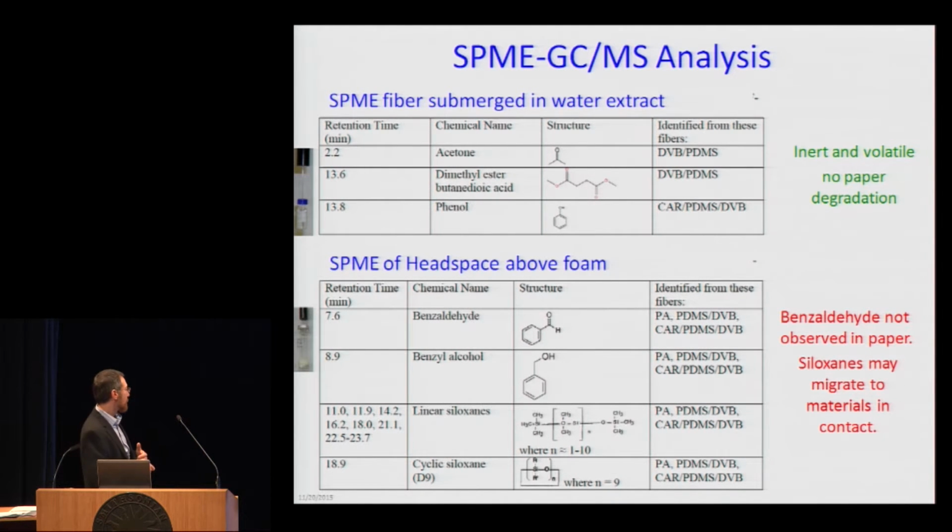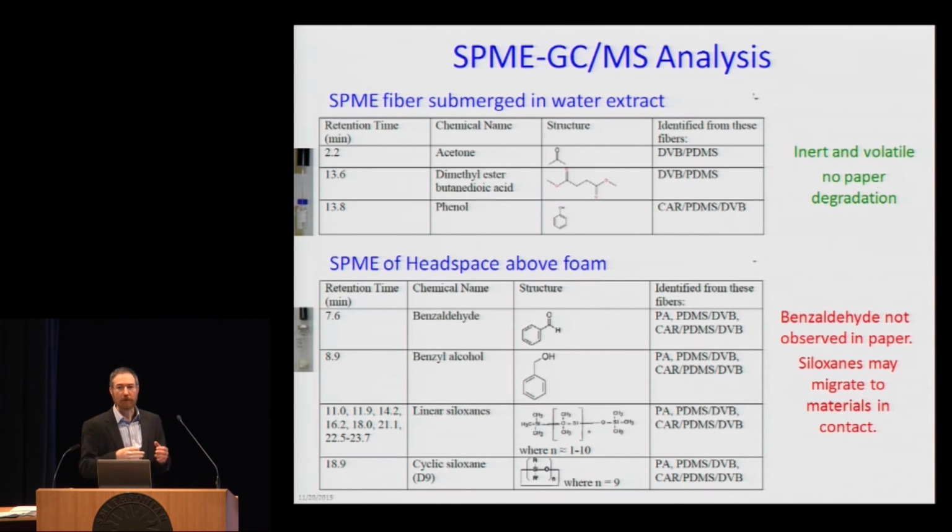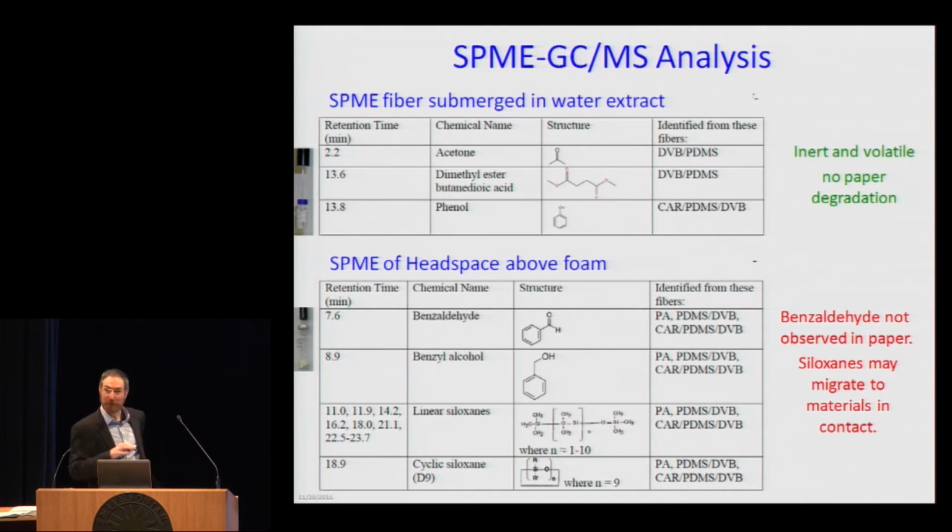The headspace SPME gave us more information, and one of the compounds that was mentioned yesterday was benzaldehyde, and so I did see that with this silicone foam. But even more interestingly, we found lots of long chain siloxanes. So Chris's adhesive showed long chain hydrocarbons. This is kind of the same thing, except there are silicon-oxygen chains instead of carbon chains. This is the kind of stuff that they used in potato chips to fry them a long time ago, and the food just went right through us. I don't remember that. So pretty inert stuff, but it can grab onto some of our vitamins and things. It still can migrate and affect the physical properties of whatever it's touching.